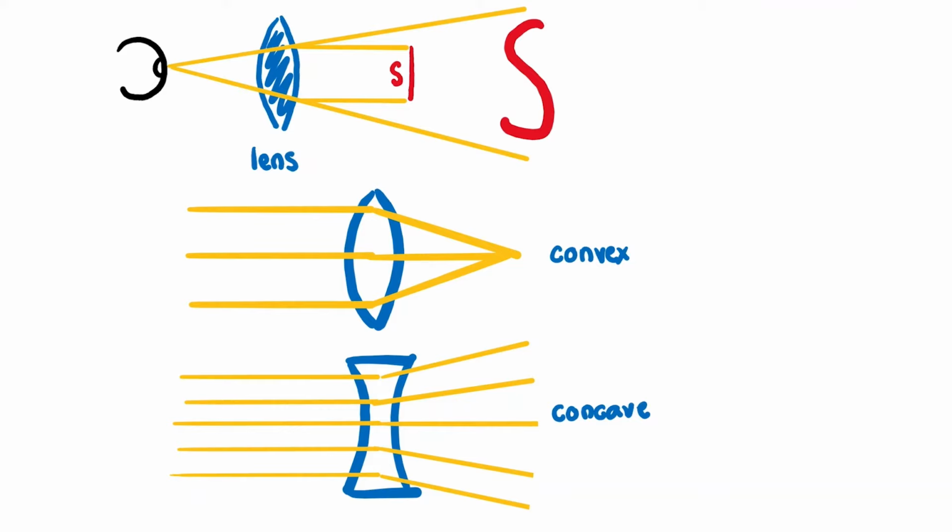All right. So now that we've gone through magnification, how light works and how it passes through the microscope, as well as the different parts of the microscope, we've kind of wrapped up our tour of the microscope.